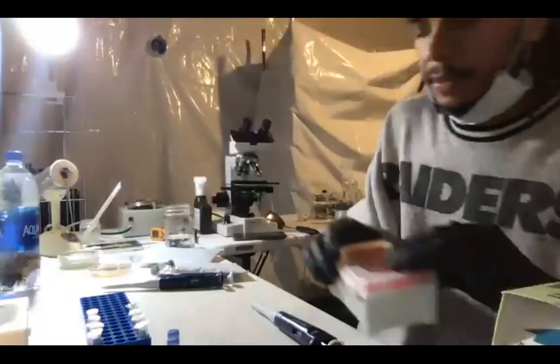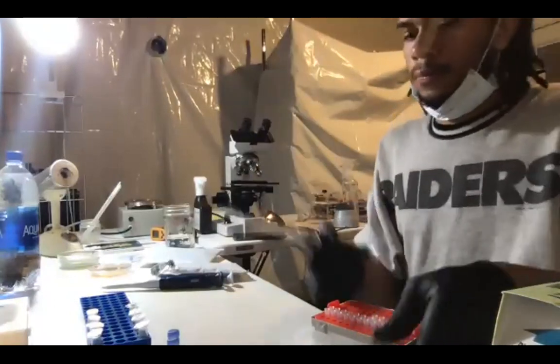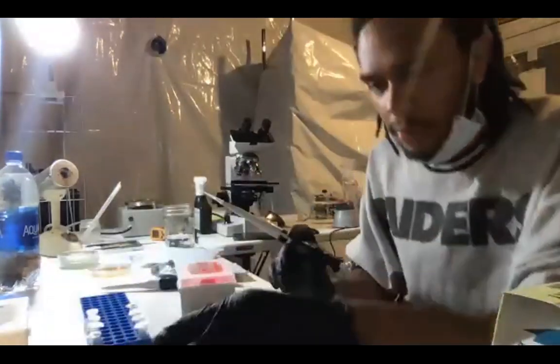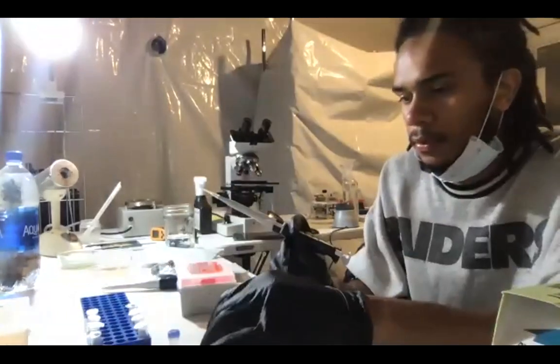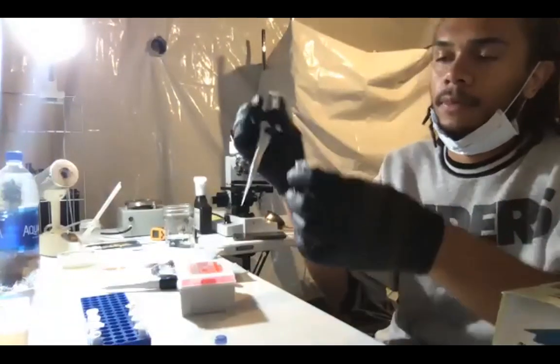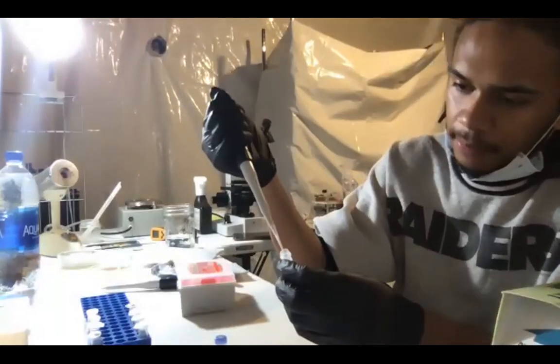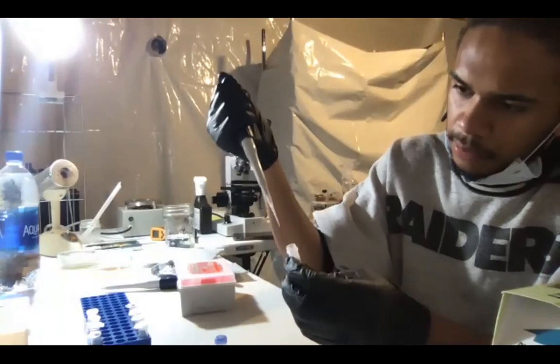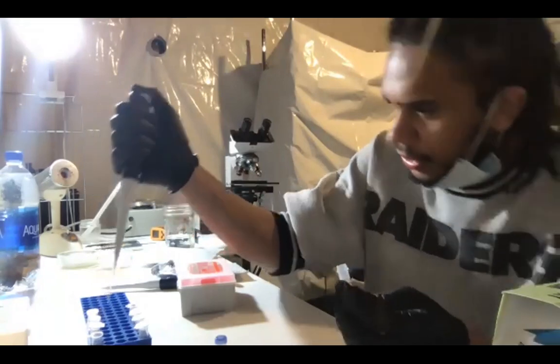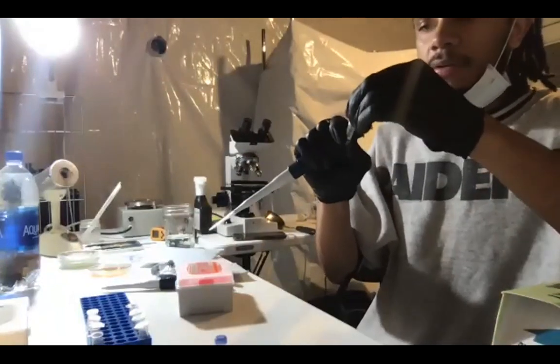I've got my smaller pipette tips here and my empty tubes. I'm going to start with the MAT1 forward. I'm going to take 1 microliter, and you really don't want to mess up and get these contaminated because that'll mess up a lot. Again, go to the first stop, draw up some liquid, and drop that on the side. It's literally just a tiny drop, like a tenth of a drop, I think.